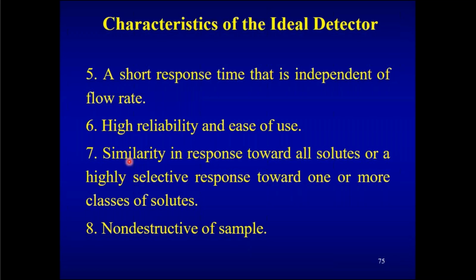So the next desirable characteristic is similarity in response towards all solutes, or a highly selective response towards one or more classes of solutes. This we will see, because some detectors are general purpose detectors which respond to many kinds of solutes, and some are selective detectors which respond to one or more classes of solutes only.